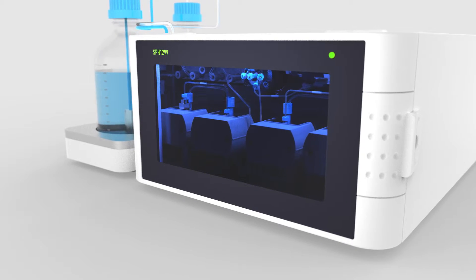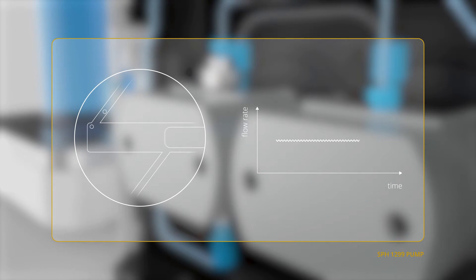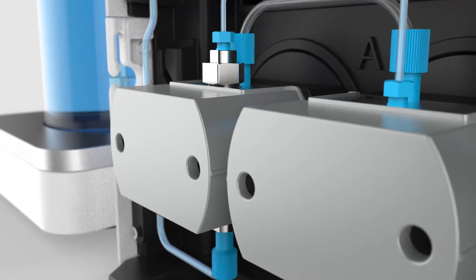Smart innovation of the pump chamber, as well as integrated degassing, effectively eliminates air problems. By concept, plunger pumps are sensitive to trapping air in the pump chamber, causing unstable flow delivery. A novel innovative design of the pump chamber, with clever positioning of the inlet and outlet, has eliminated the air problem.